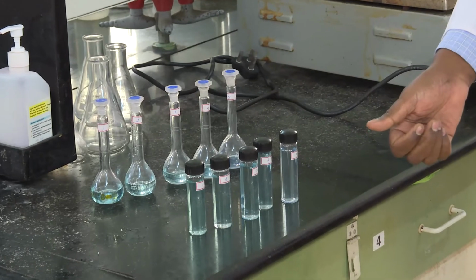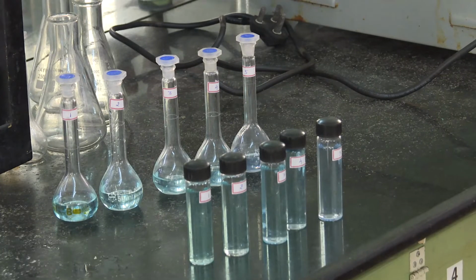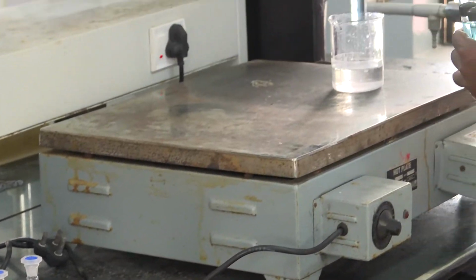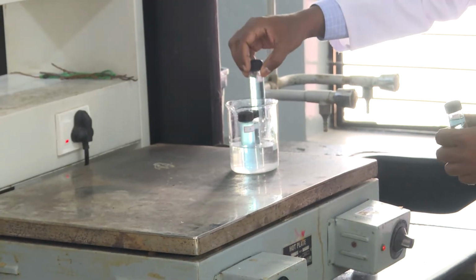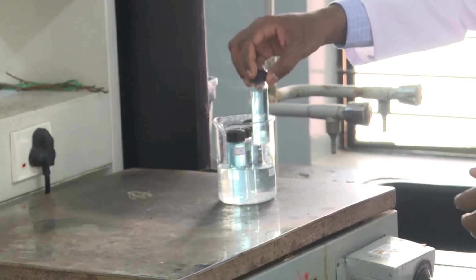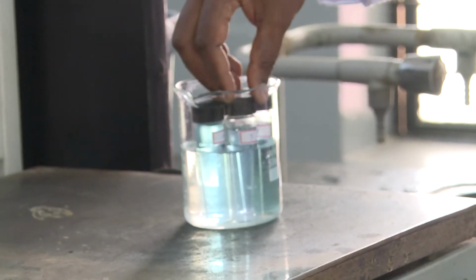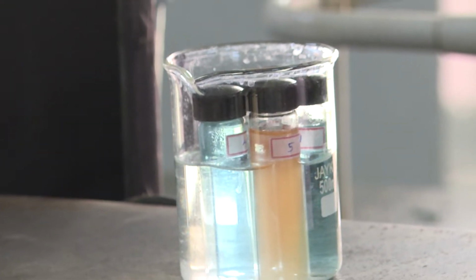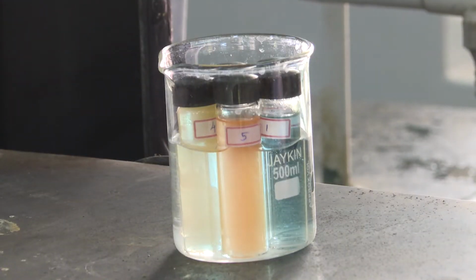Now we are going to heat this sample in the tube in a water bath. So we are going to transfer the sample into the water bath, that is the 500 ml beaker containing water, and then we will heat it for 5 minutes. So now you can see that in 2 minutes there is a change in the color. After 4 minutes, let's wait for 1 more minute.